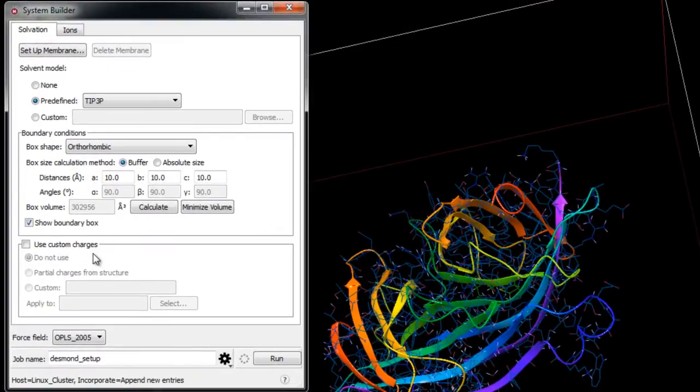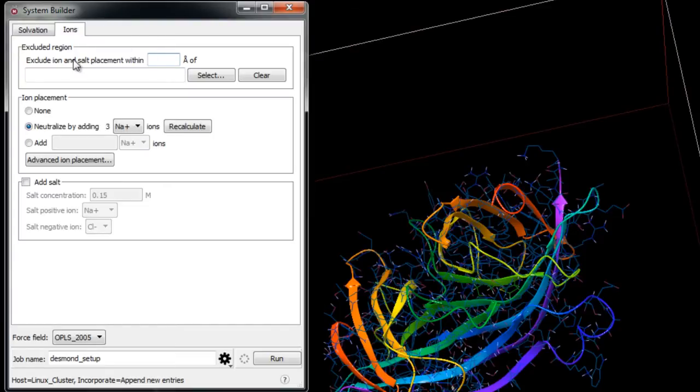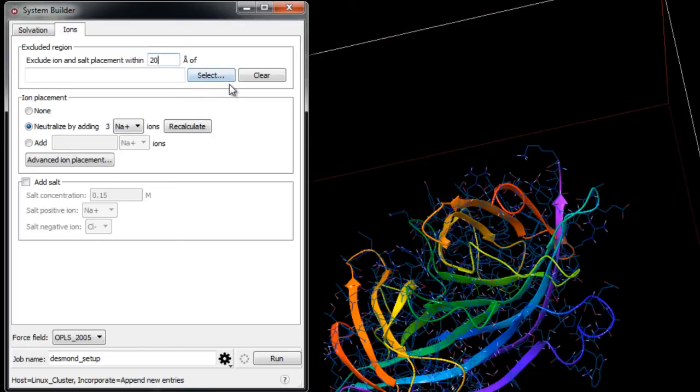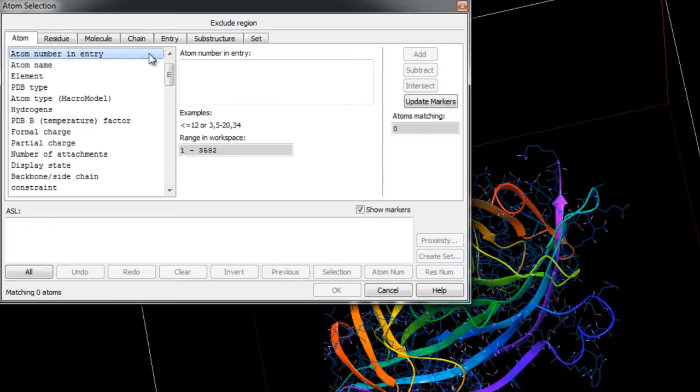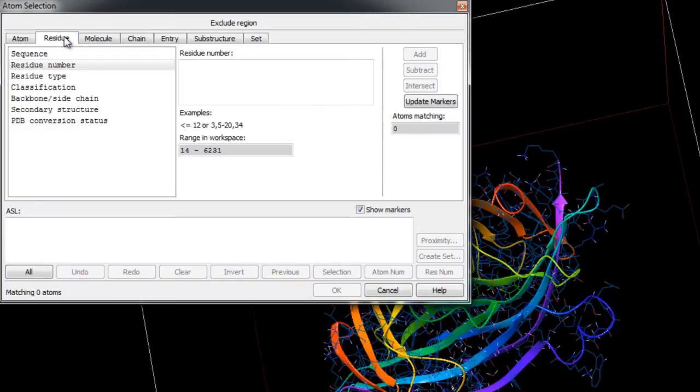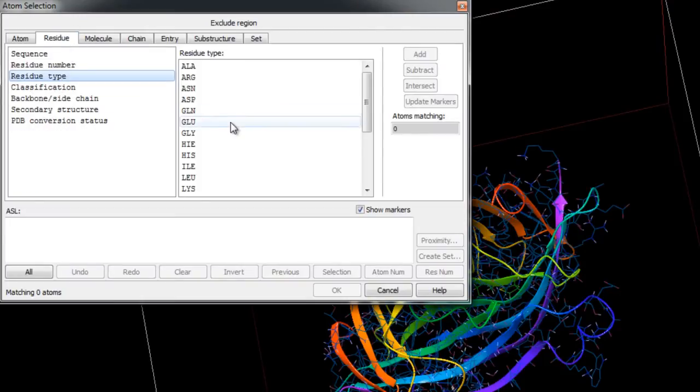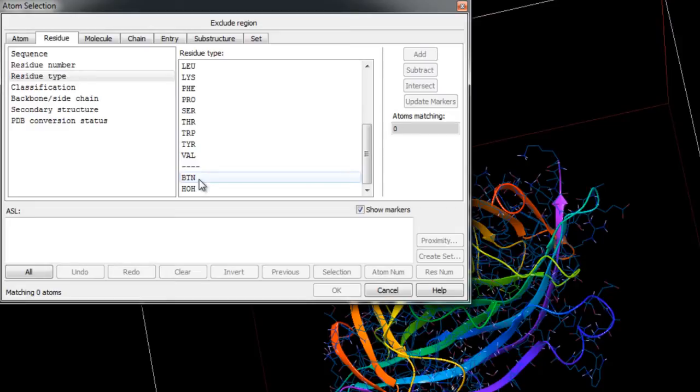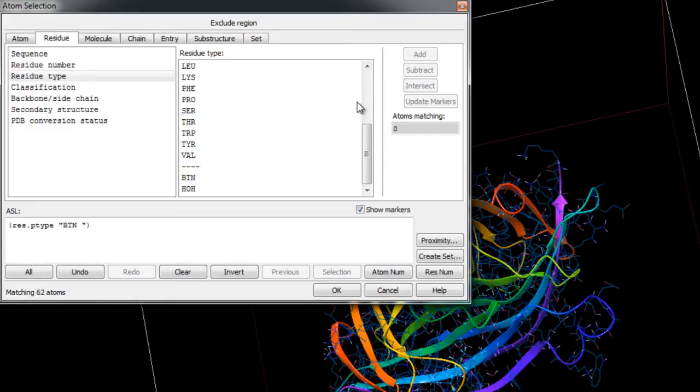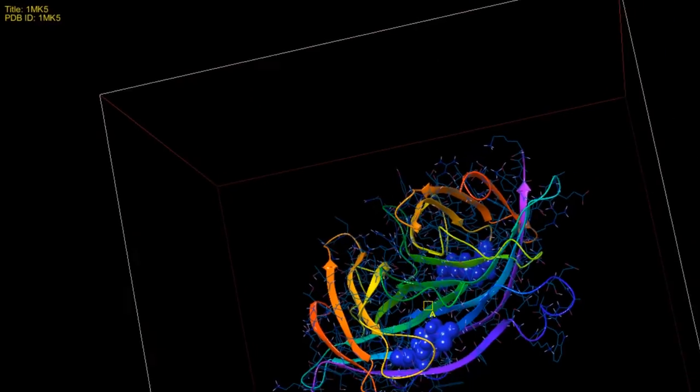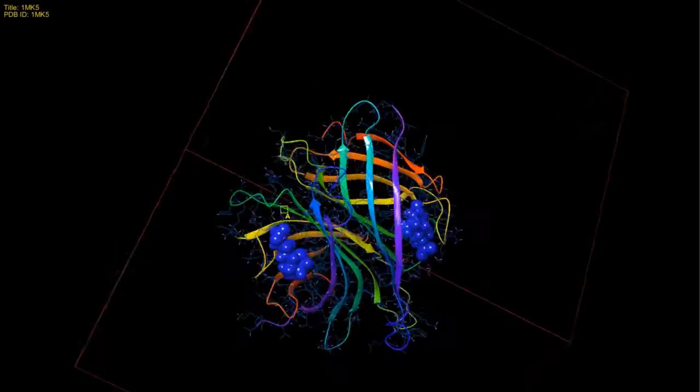So let's go to the Ions tab. Now here we can exclude a region from the placement of ions and salts. Let's do that in this example, so we'll place them say 20 angstroms away from the two biotin ligands. So we'll need to click Select, then in the residue tab choose Residue Type and then BTN, which corresponds to biotin, then click Add and OK. Now you'll notice that the two biotins are shown in CPK representation.